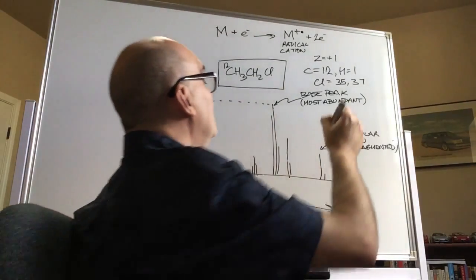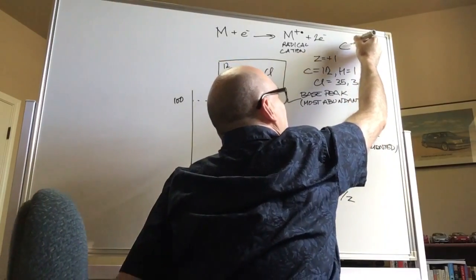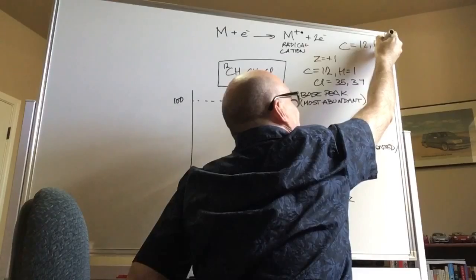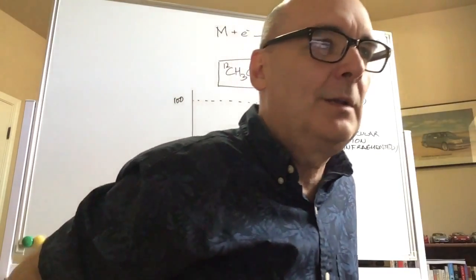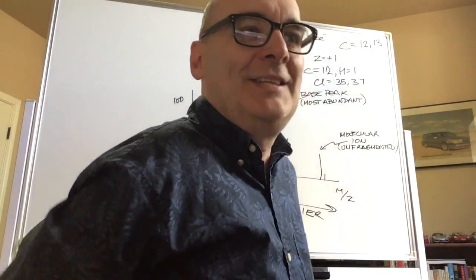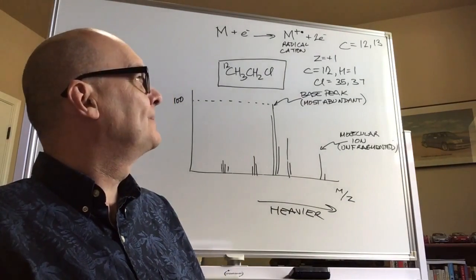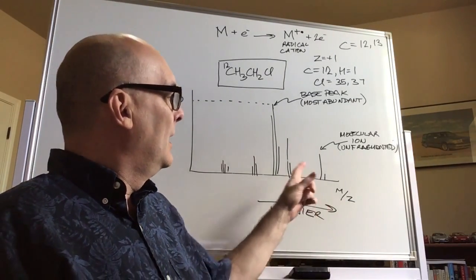And because we know that carbon is 12, but there's a little bit of 13 out there, about a percent of carbon 13.